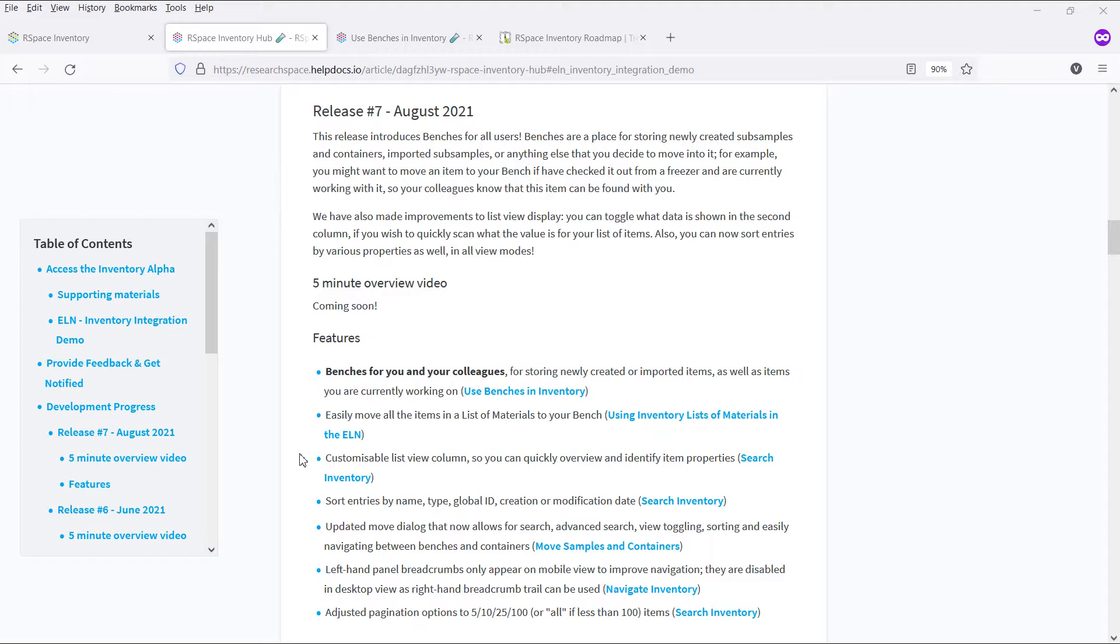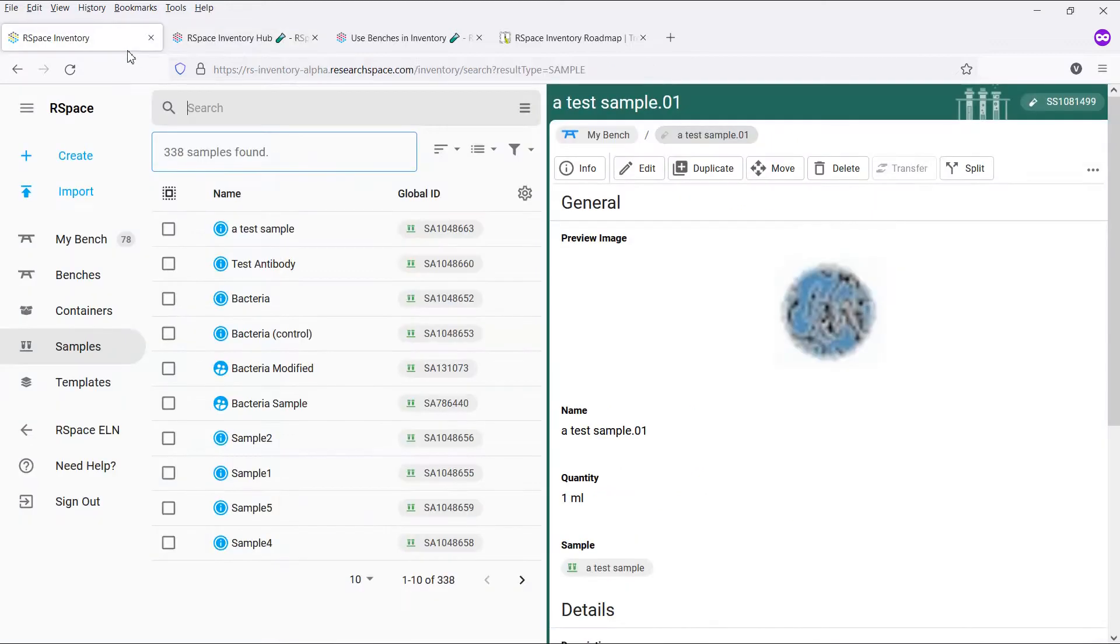We have also enhanced the interface by adding more sorting options for various item properties, as well as the ability to toggle what data is being shown when viewing items in ListView. Let's have a look at these new changes.